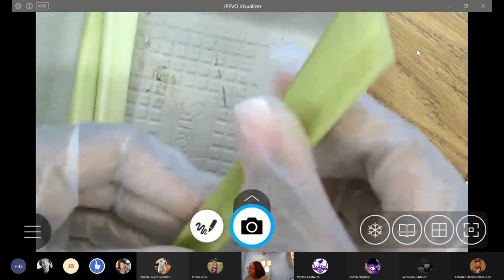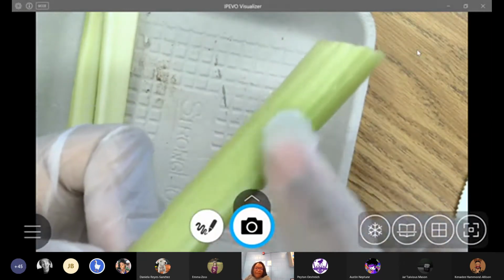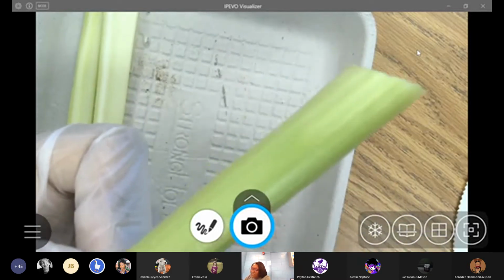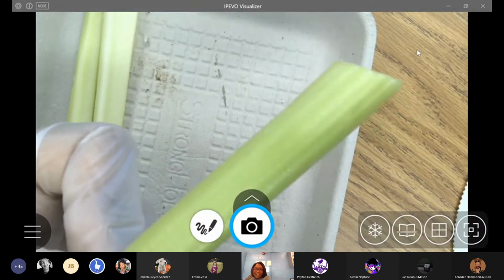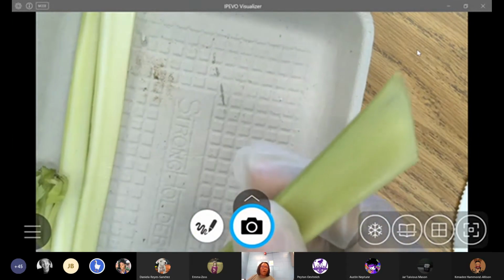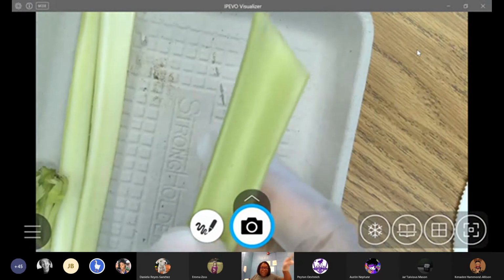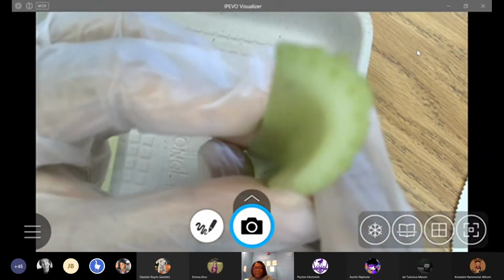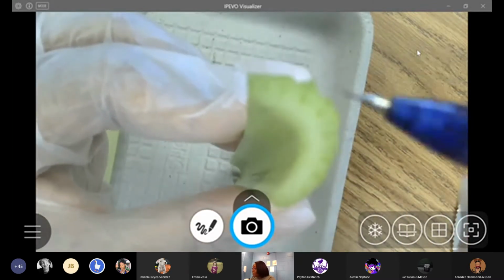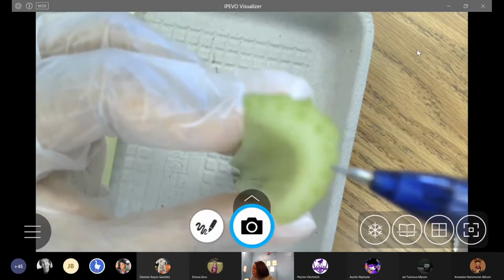So when we're looking here at our celery stalk, we see this is the actual stem, and these ridges that you see here, I bet you never paid attention to. They're extremely important. This is actually showing you each of the bundles, each of the xylem and phloem. Each of those ridges is a piece of the xylem, the highway there, or the phloem, okay? So when we're looking here, remember we drew that picture of the cross section of it? Look closely here. Do you see, and I'll show you with my pencil, those little bitty dots there? And they are happening in a little row.